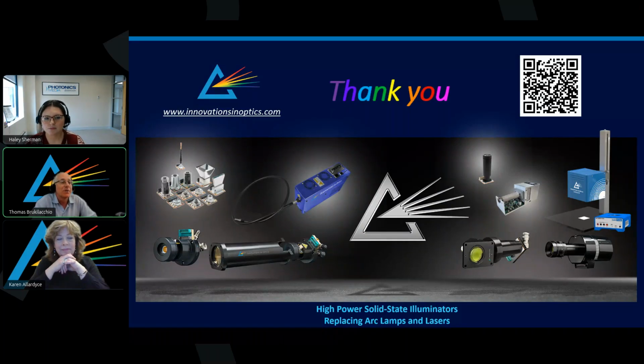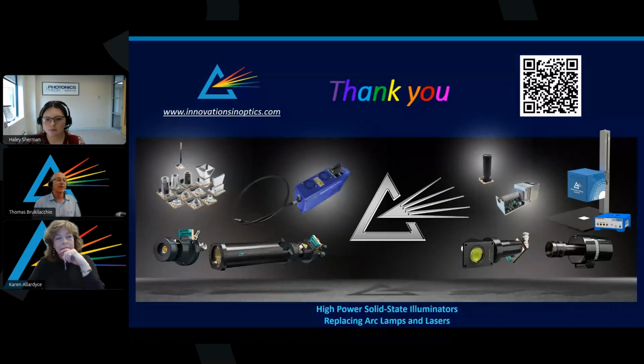modality, and measurement objectives. Also, it's important to consider all aspects of the design, optimizing optics, thermal management, electronics, spectral performance, packaging, reliability, and cost. Increasing optical power raises junction temperature, which affects efficiency, wavelength stability, and lifetime. Improving spectral flexibility often increases system complexity. Many of the performance metrics are interdependent, so improving one parameter may negatively affect another.